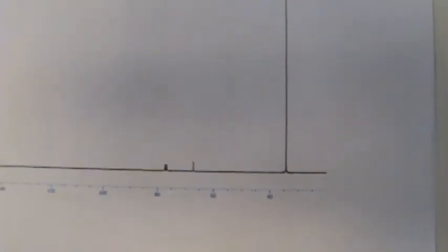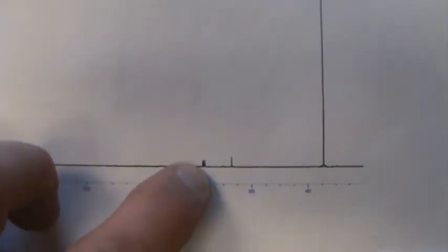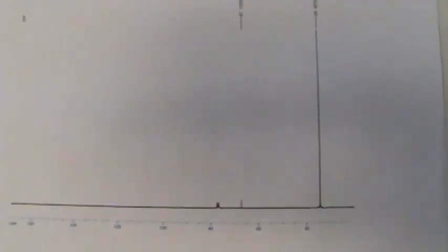Carbon 13 is going to look very similar to the starting material. You can see the chloroform-d at 77. That's the quaternary carbon of our compound and the methyl groups. So that right there is a quick run through of the IR and the NMR for this experiment, which is kind of nice and simple. There's not too much going on.